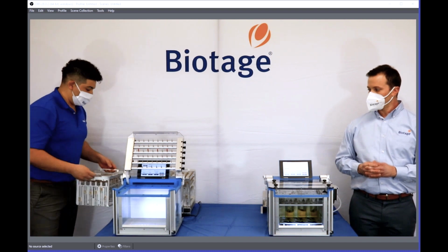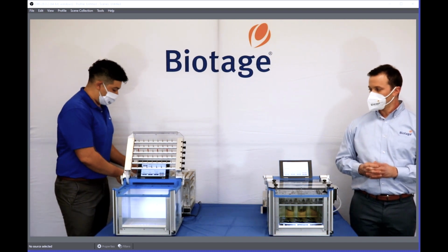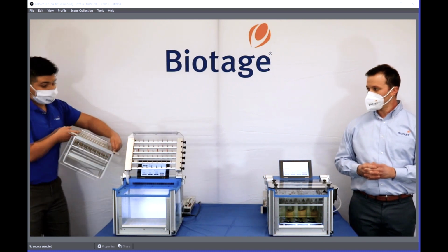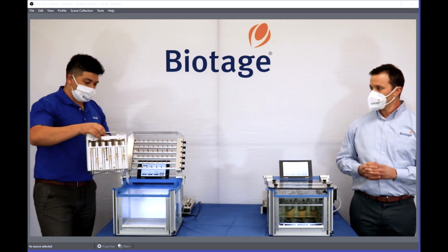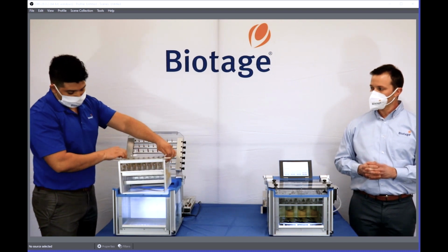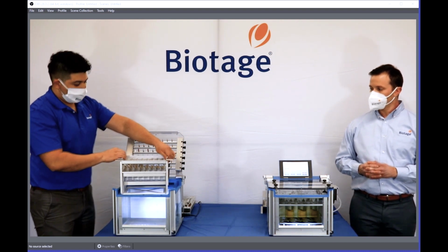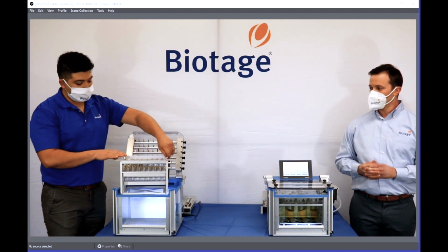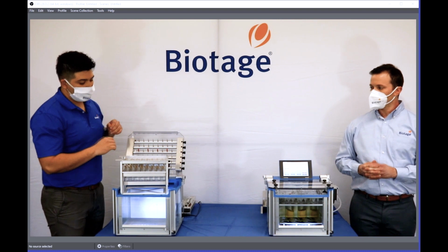Now, I know some of you may not necessarily need a rack to adapt to 50 mil evaporation, or even 200 mil evaporation. Now, what if you're using a 12 by 75 culture tube, a 13 by 100? Well, we have our multi-rack here that will accommodate that workflow.